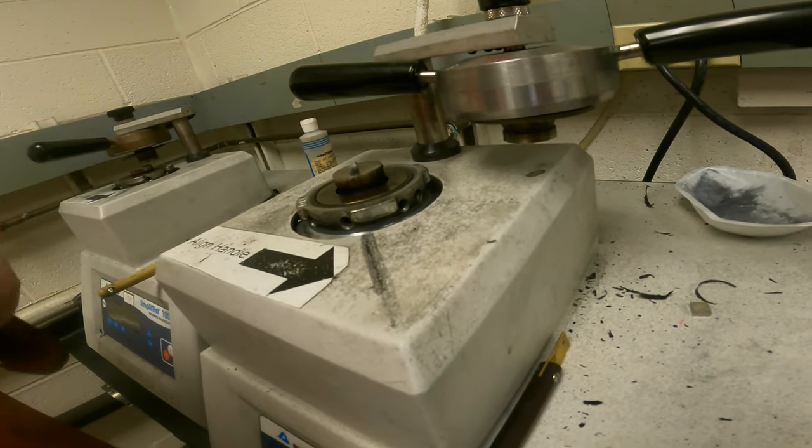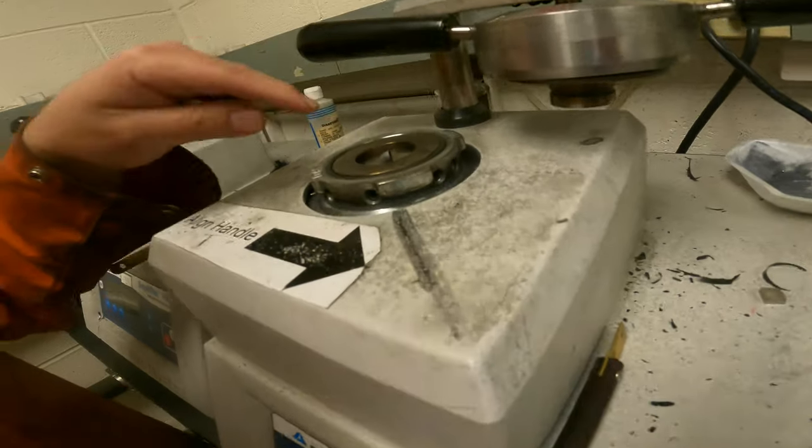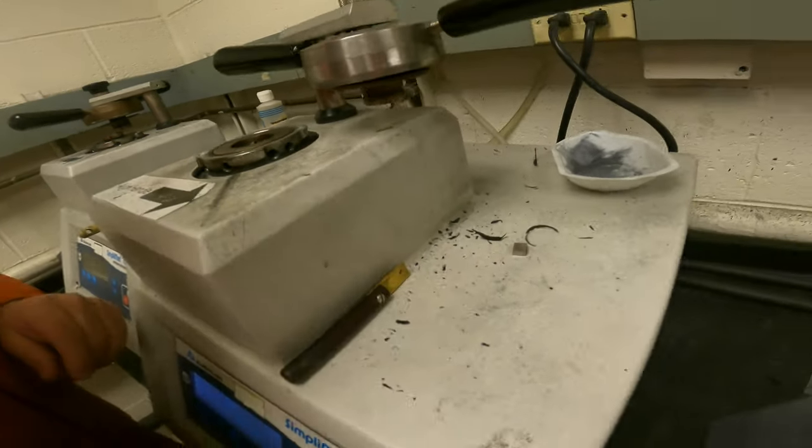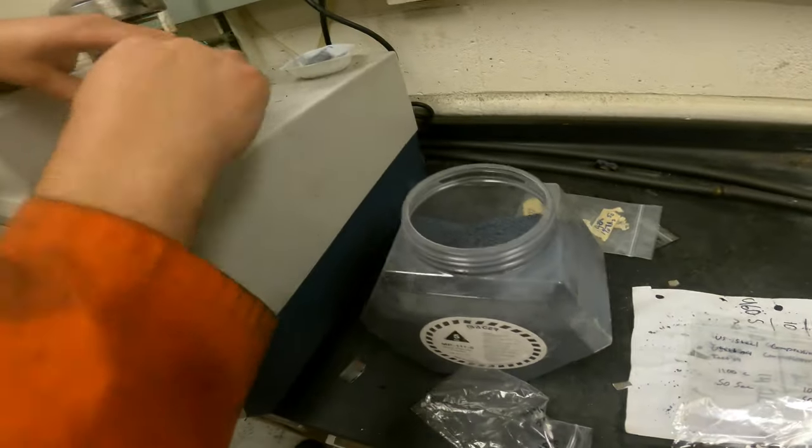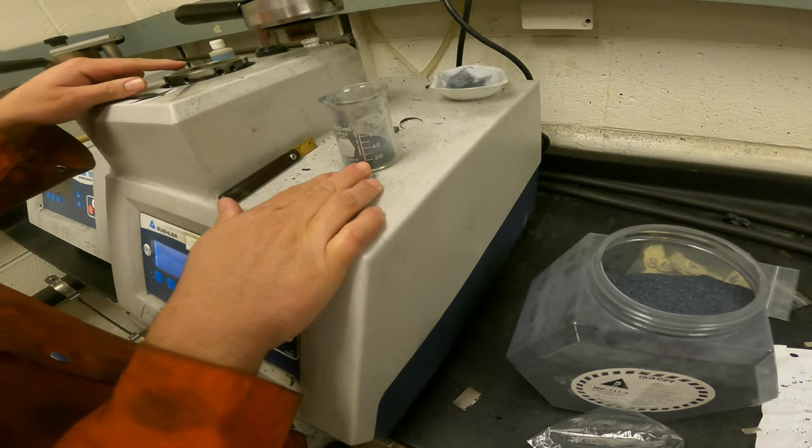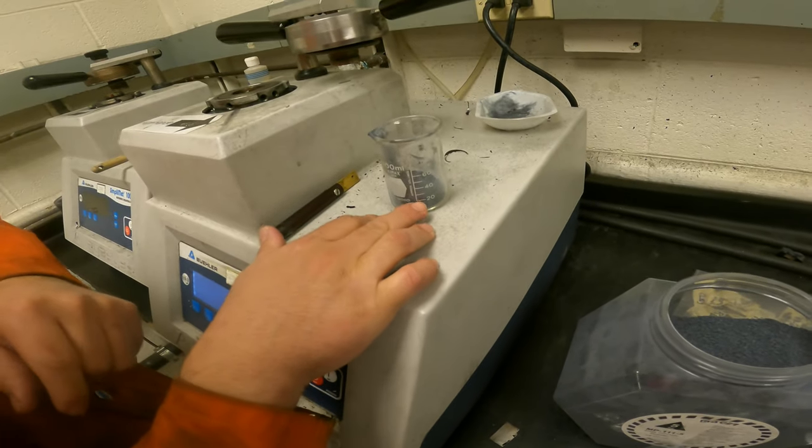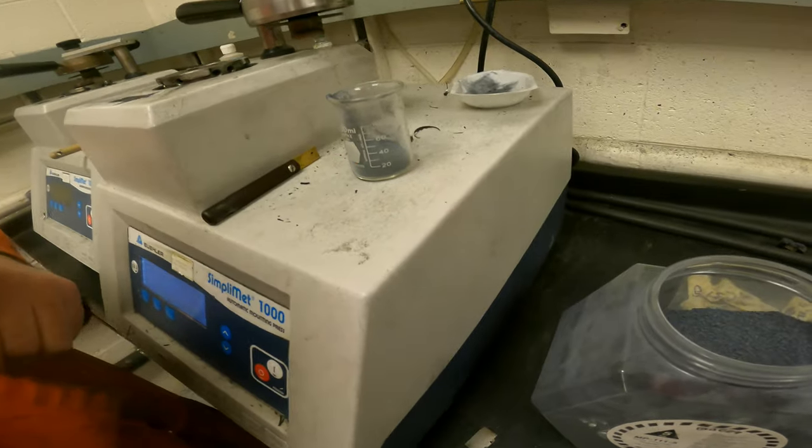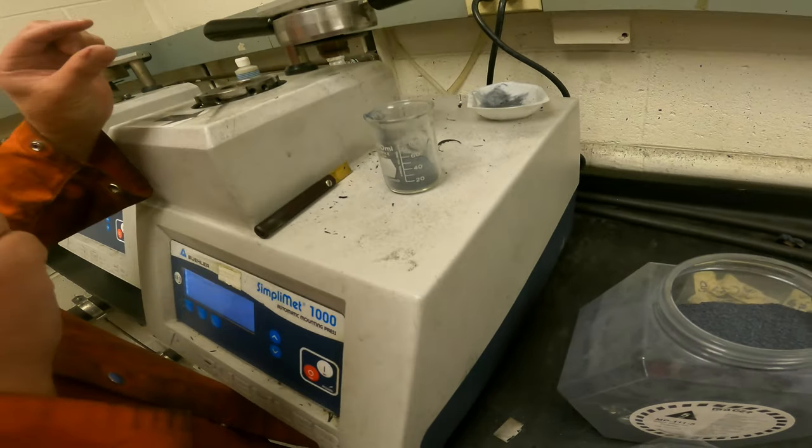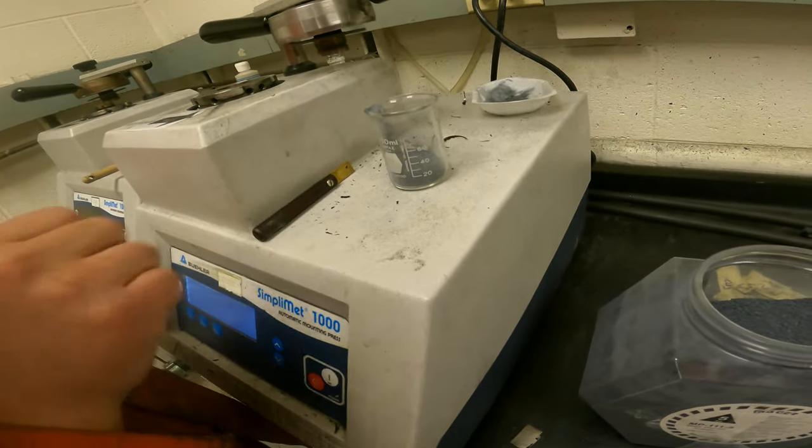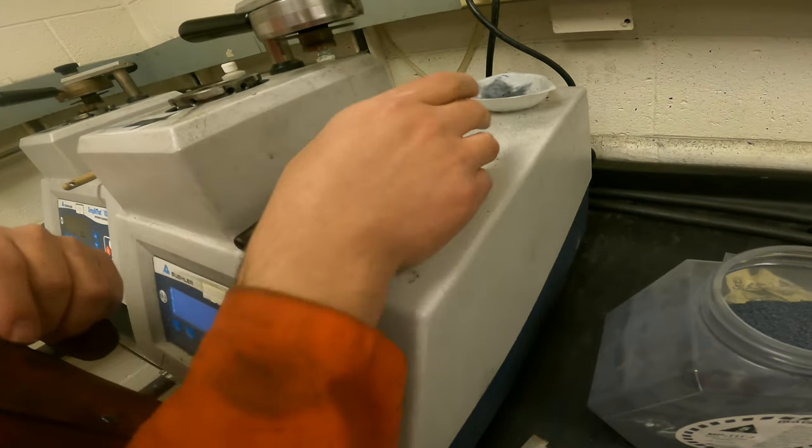So I place my sample and start to lower the ramp, so the sample starts to go down. Now I'm going to prepare my powders. Depending on the experience, usually for big samples I use 20 milliliters of the resin. In this case, because the sample is tiny, we're going to use 30 or 35. It doesn't need to be exact.